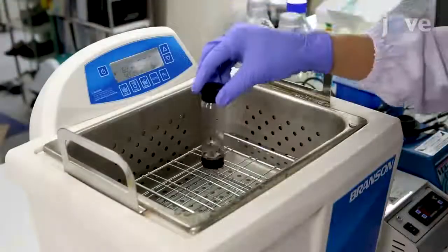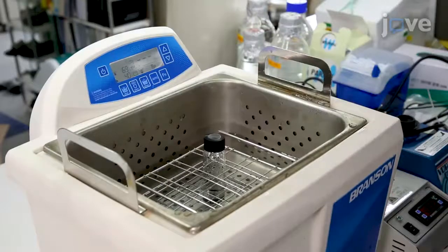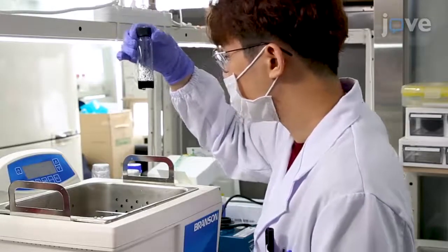Then sonicate the solution at 60 to 80 degrees Celsius and 160 watts until the MWCNTs settle at the bottom of the vial, which usually takes about 1 hour.